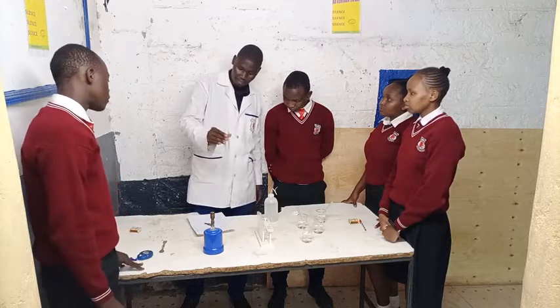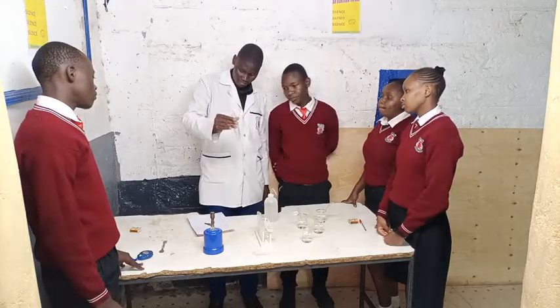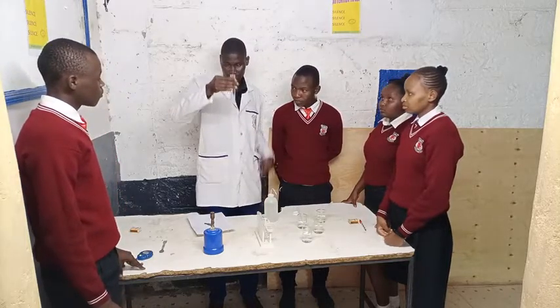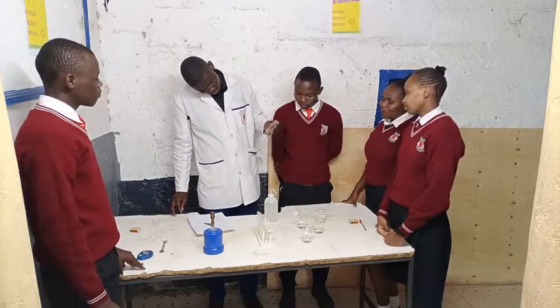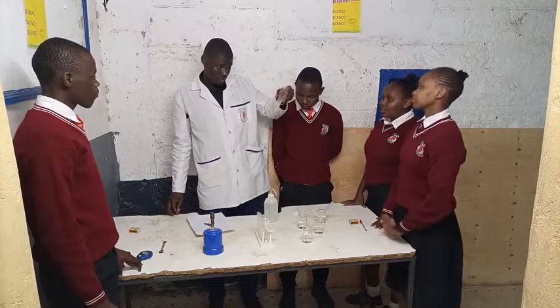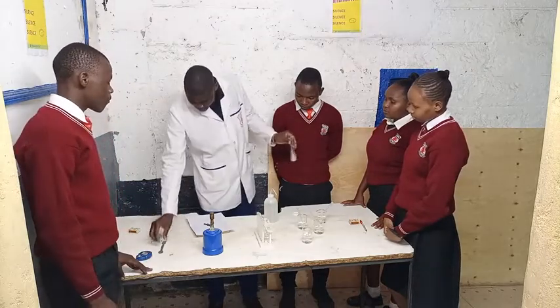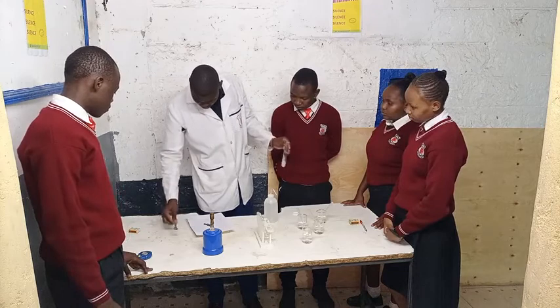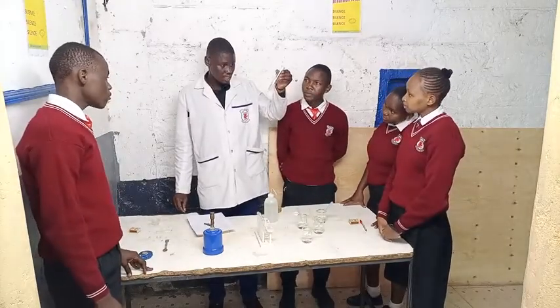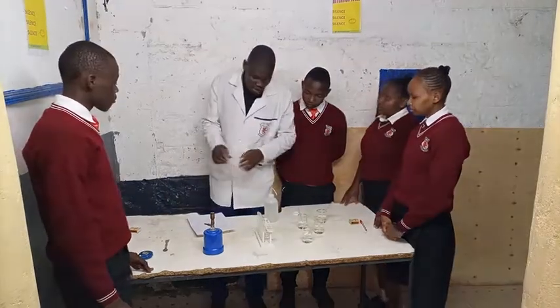We are shaking, still shaking. It's still hot, so just relax. Now, all the solid is dissolved.